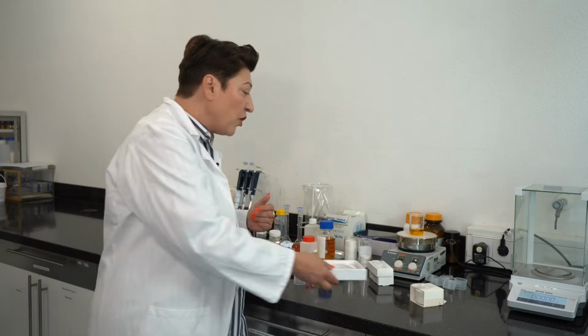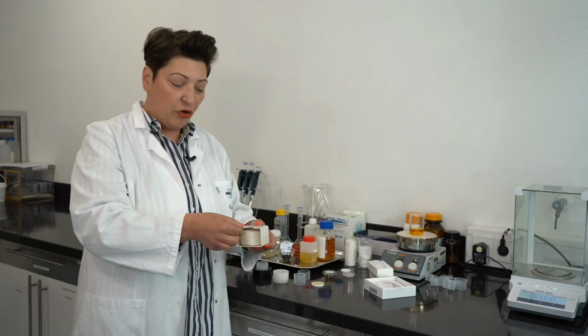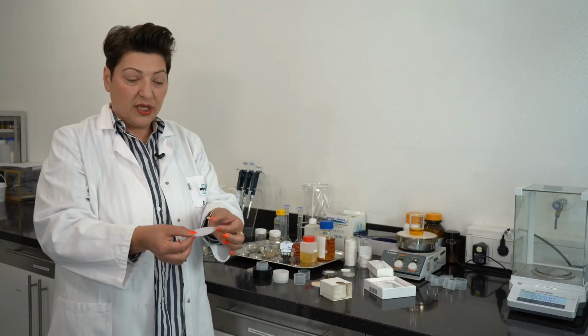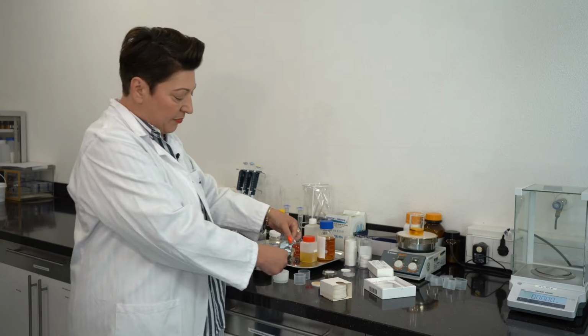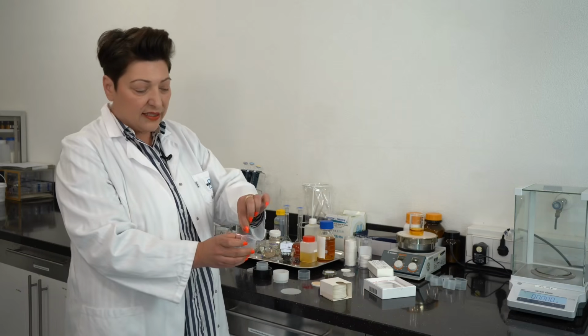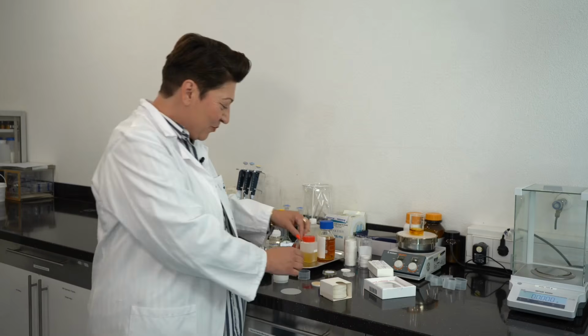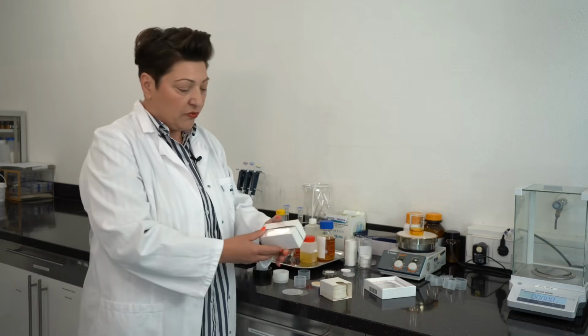Yes, they are a little bit more expensive. Then you can also have these pre-cut foils. They are already pre-cut, so you have to remove them from this tray and then prepare the sample. Sometimes, depending on how thin the foil is, it needs a little bit of training and handling to prepare these kinds of cups.